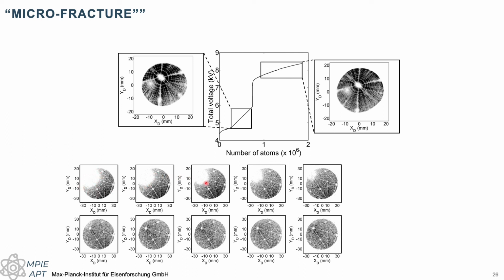The specimen progressively reshaped, and we end up in good field evaporation conditions again. What happened during the fracture is quite difficult to know, and there might be that there was heat exchanged when the sample fractured. So it might be that the microstructure actually was changed by this process. So again, whether you want to trust that data or not might be questionable.